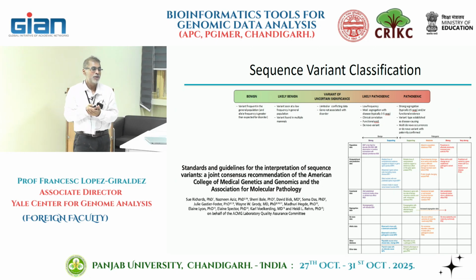De novo variants are important for autosomal dominant diseases. So in autosomal dominant disease, if you have a variant in a child, but that variant is not present in either of the parents, it's a de novo variant. So that variant is upgraded. But the only caveat here is that there could be variable penetrance. In some of the autosomal dominant diseases, the father and the child may have the same variant, and the father may have no symptoms at all or very mild symptoms, whereas in the child the symptoms might be more severe. So that can be an issue, but normally if your variant is de novo in the context of an autosomal dominant disease, then it's more likely to be pathogenic.